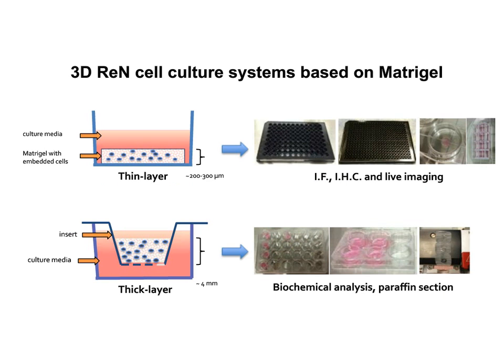And after that, we start differentiating. So I can explain why we made 2 different 3D culture systems. Because one of the 3D culture problems is that it's very thick, so it's not that easy to measure what's happening in the middle of the gels. Especially there are limitations with confocal and others. So we wanted a system where we can easily do immunostaining, immunohistochemistry, and have enough material for biochemical studies.